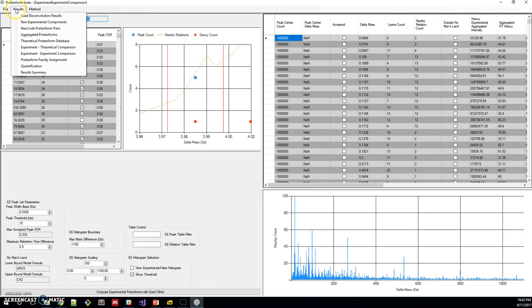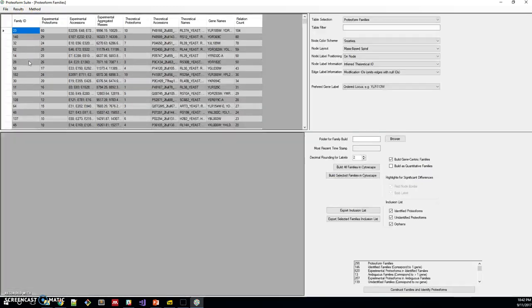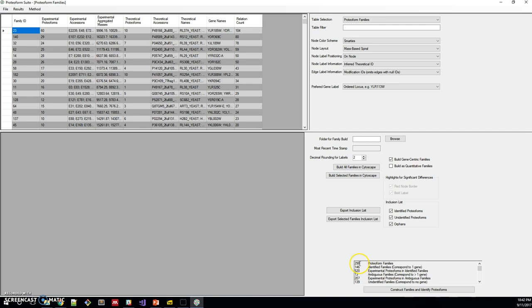We do that again for comparing experimental masses to other experimental masses. And then we join all of those relations to form proteoform families. This is where it starts to get more exciting. We form about 298 proteoform families. I'll show in a different video how we construct those in Cytoscape to visualize these results.